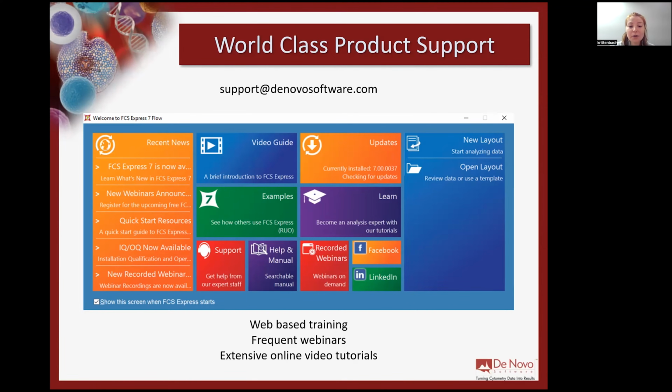We're happy to help you to make your analysis more efficient. We also have a ton of resources available for your learning on your own and for referencing.